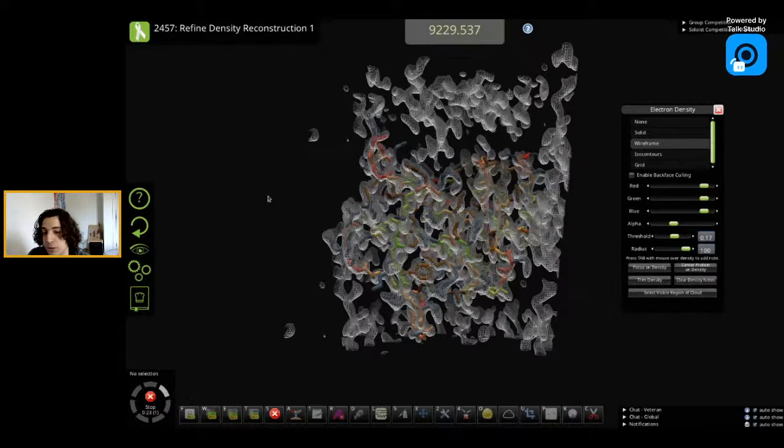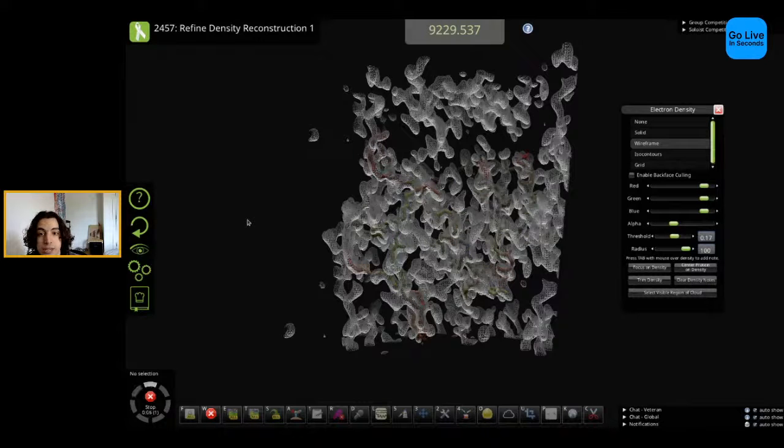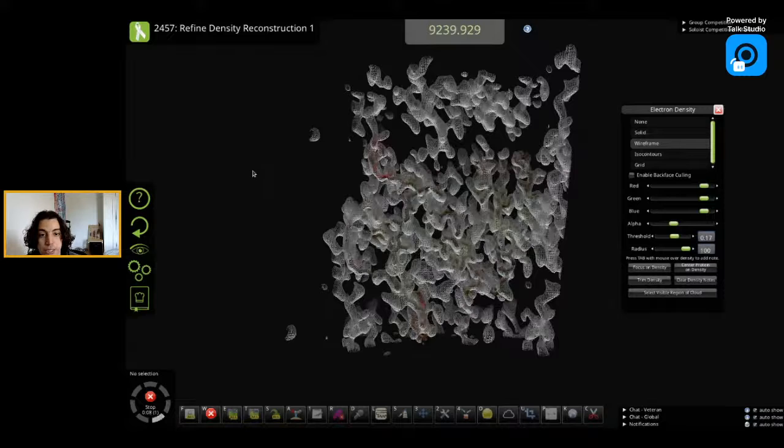It seems to be going a little bit slowly because I'm also running a stream from the same machine. But I'll wiggle as well and get rid of any major issues that we're seeing with the backbone geometry here.